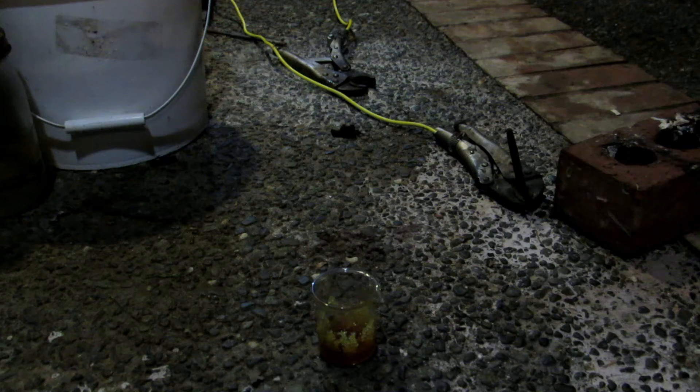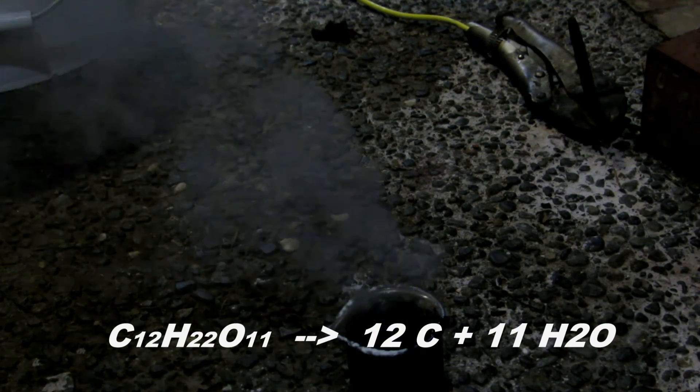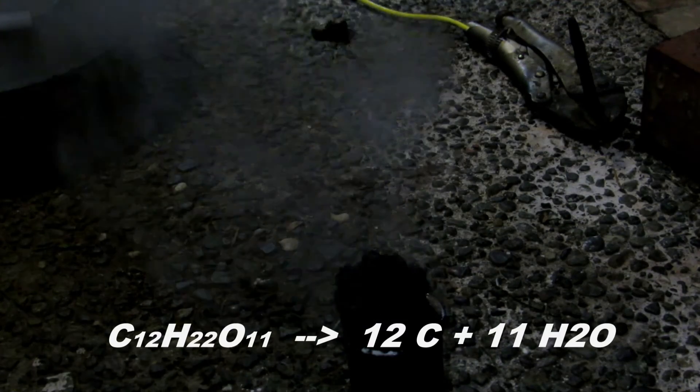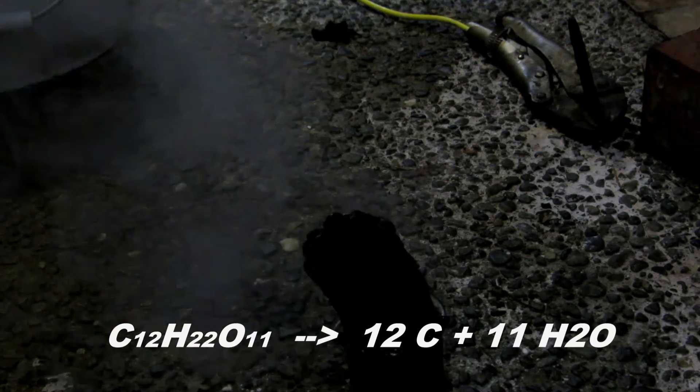This will produce elemental carbon, which we can rinse of impurities, and we'll have some quite pure carbon powder. The reaction looks like it's going to get underway pretty soon. And there we go — a vigorous reaction is now taking place and generating plenty of elemental carbon, which is rising as this pillar. It is now very, very hot as this is an extremely exothermic reaction. You can see our lovely black carbon snake which is just emerging from the beaker.